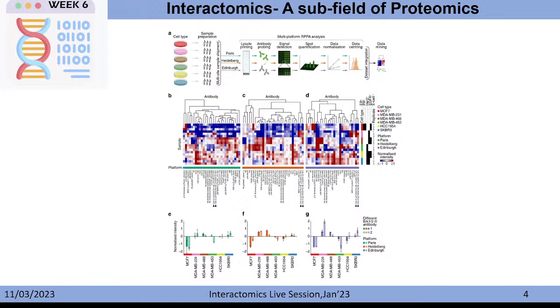Okay, so that was only captured out, so that's why the samples were prepared and then sent to them. With the different in-house setups of the reverse protein arrays, one can get results.